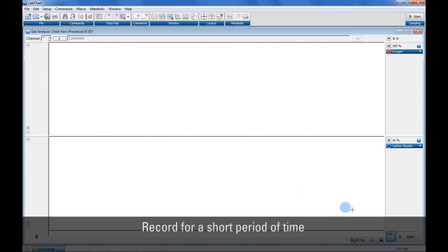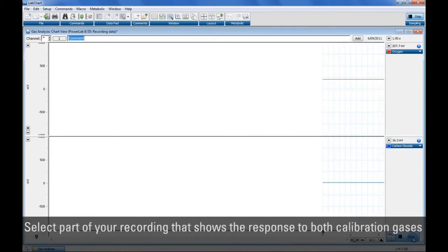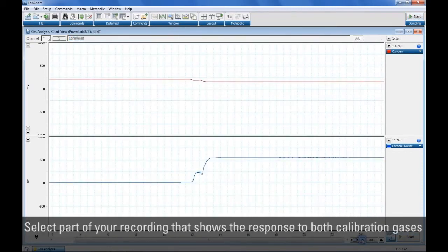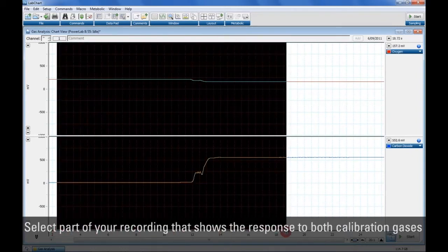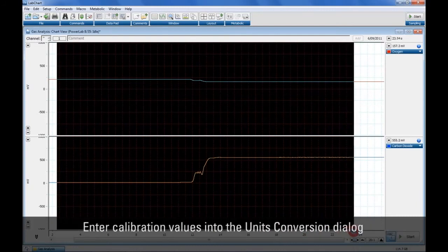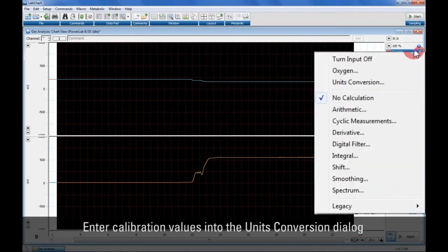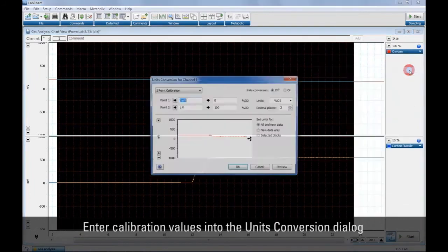Next record the transducer's response to gases of known concentrations. Then select the region of the LabChart recording that shows the response to both calibration gases.